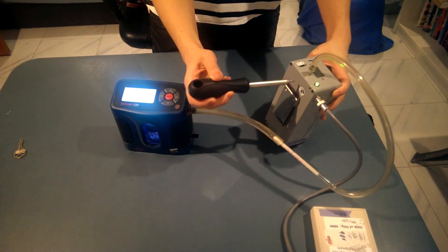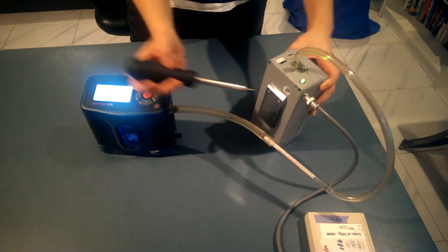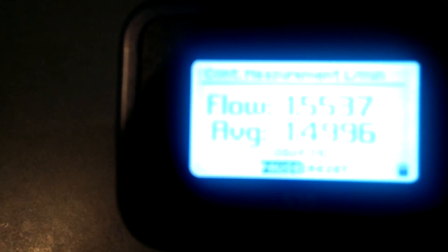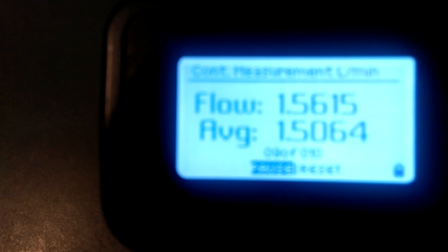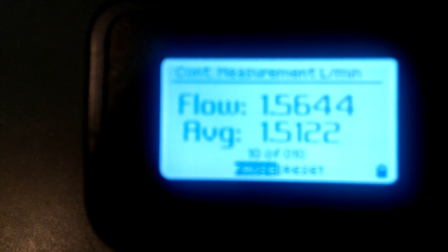You may use a screwdriver at the back of your air sampling pump to adjust to your desired airflow. This calibration method is specific to the BIOS Dry Cow Defender 530 and modified methods can be used for alternate calibrators as instructed in their manuals.